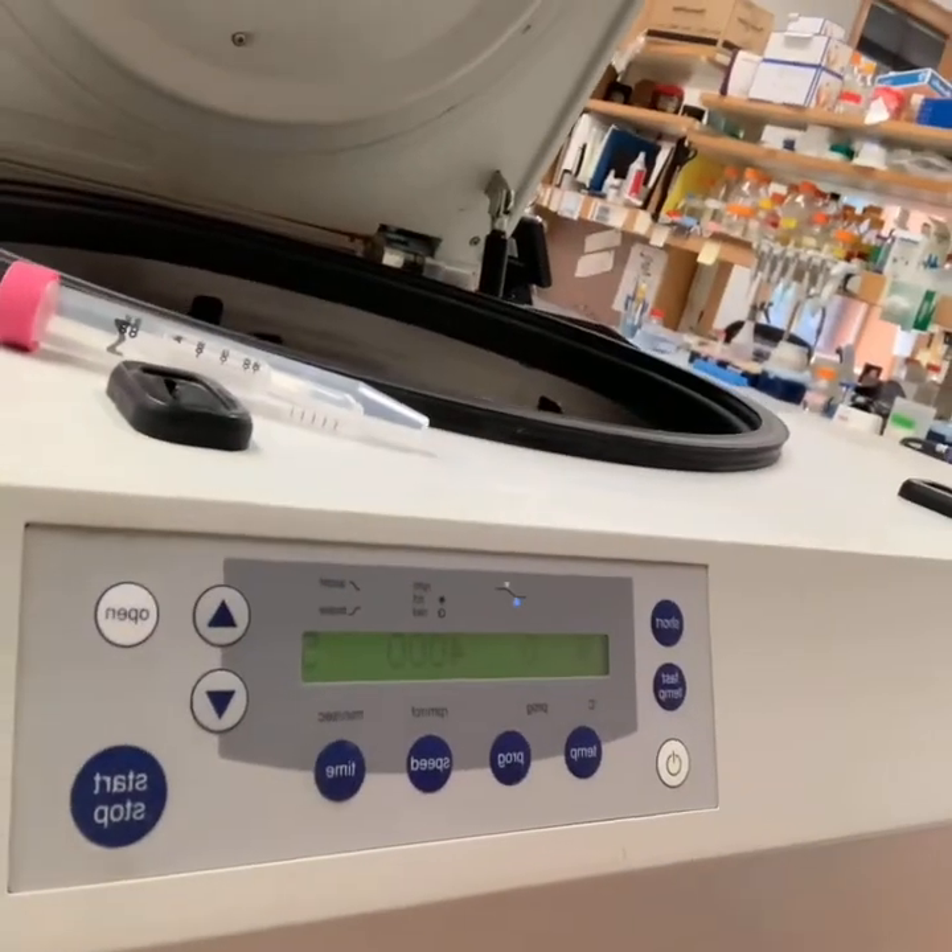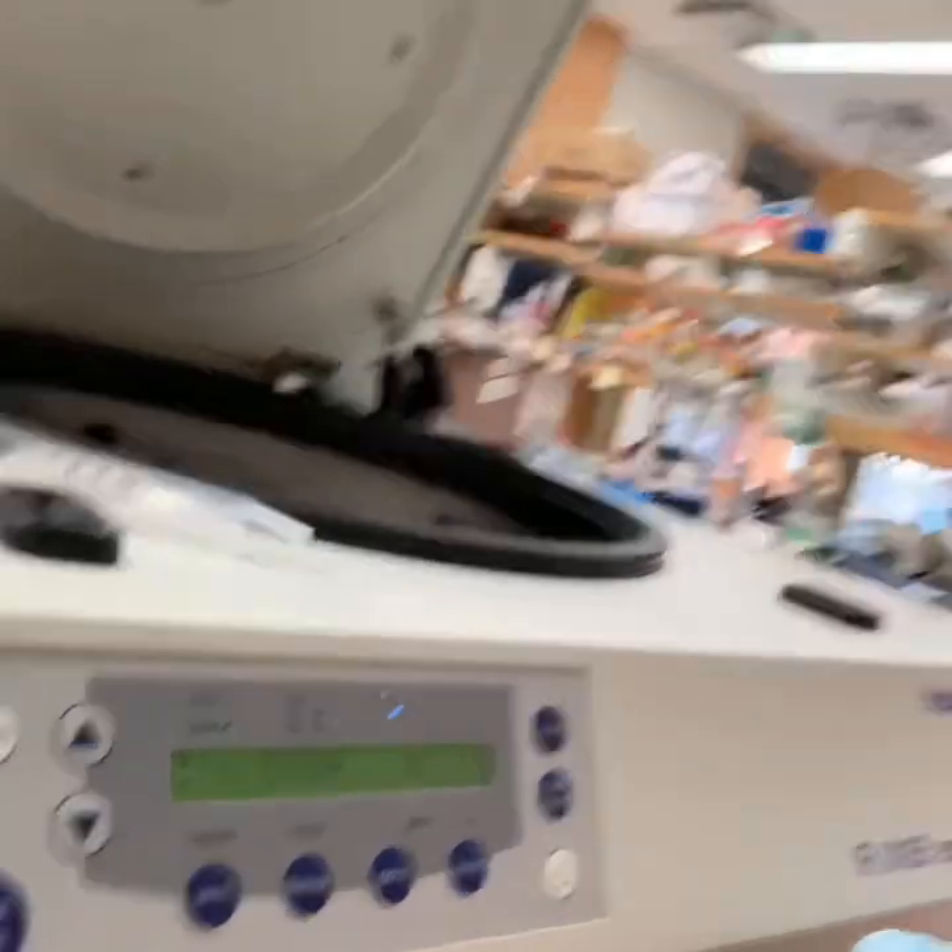We use these Amicon brand, but there are different brands and they might work somewhat differently, so you always want to check the instruction manual. For these we use about 4,000 RCF — 4,000 G — speed on the centrifuge, which is the maximum for these.